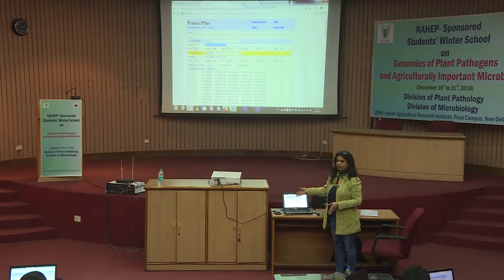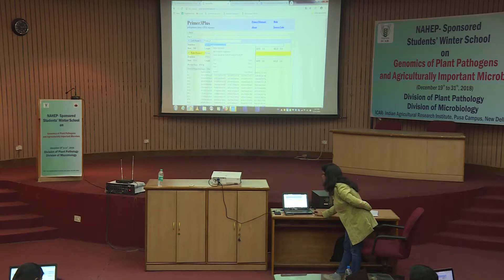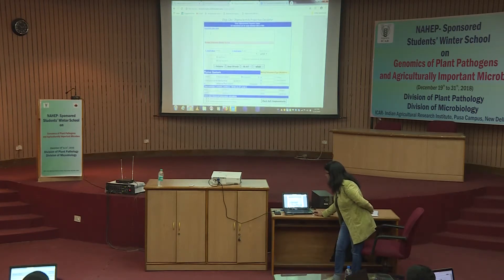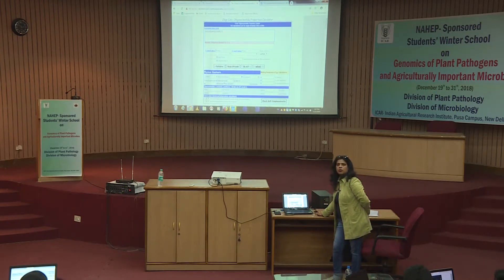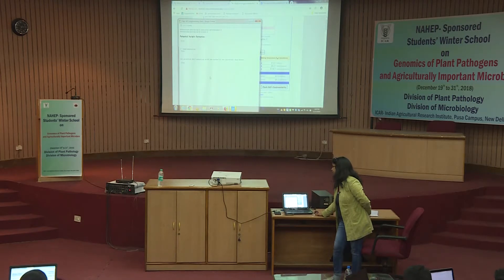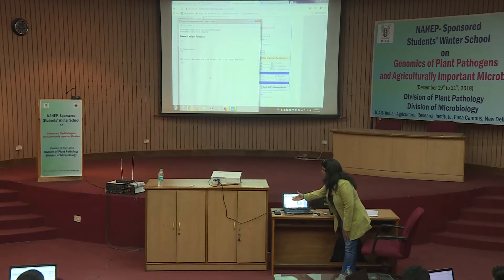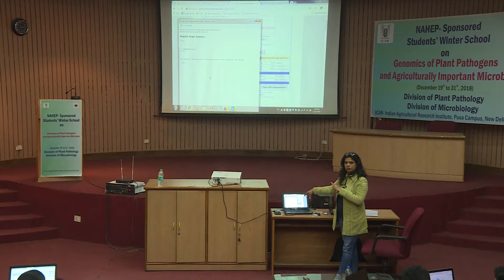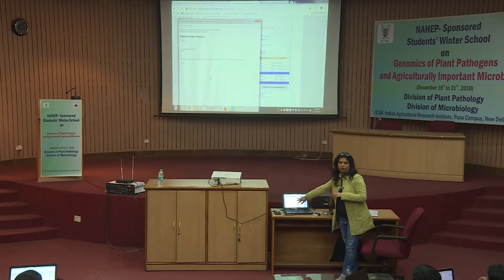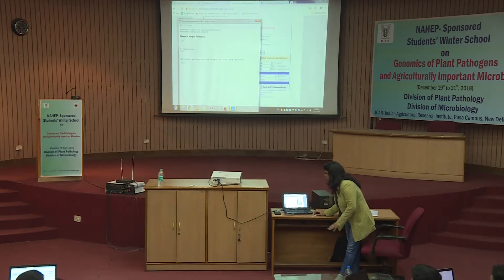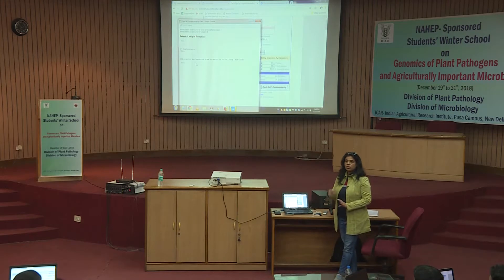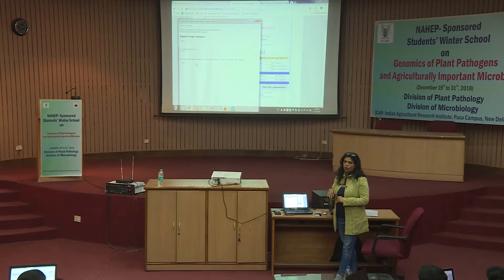For validation we will use the oligo calculator software. You select the sequence of your forward primer and paste it into the oligo calculator window, then press 'check self-complementarity.' A window will appear showing all the complementarity features of this particular primer. If any hairpin loop or dimerization is happening, it will be highlighted. Here it is showing: potential hairpin — none; complementarity — none; potential self-annealing site — none. It means this primer will work well, and I can pick it for my further studies. Do the same with the reverse primer.